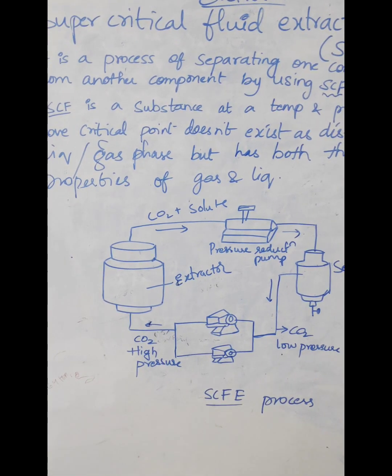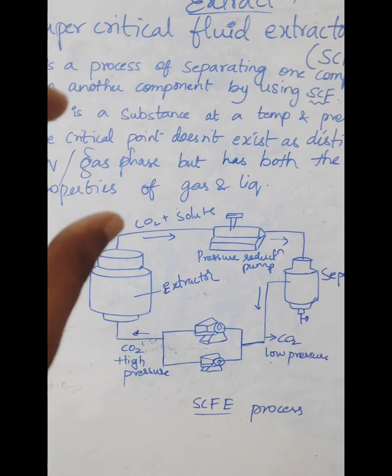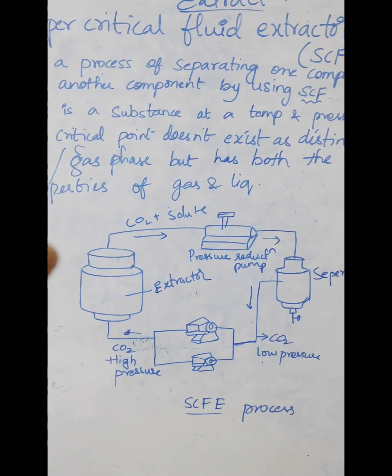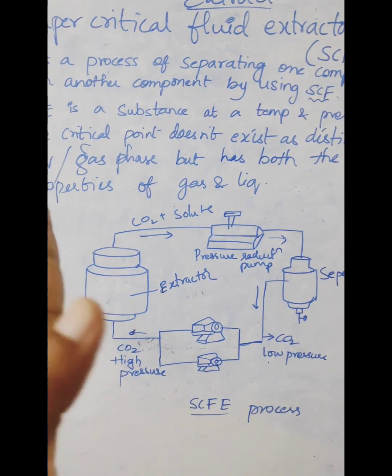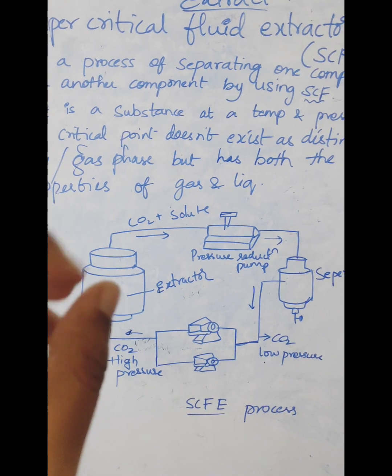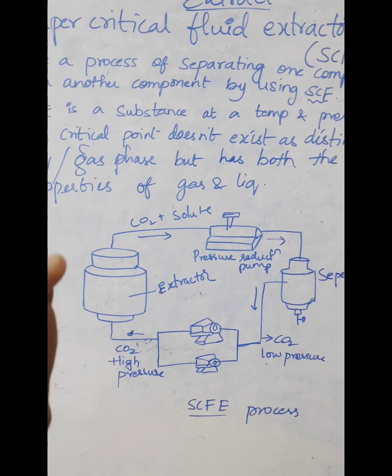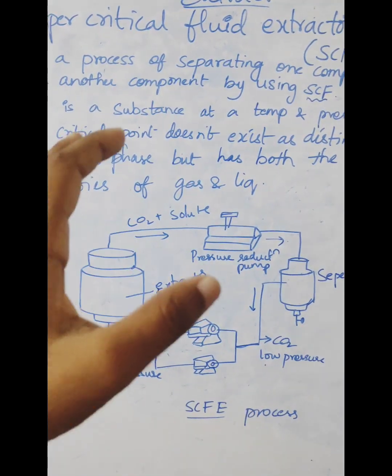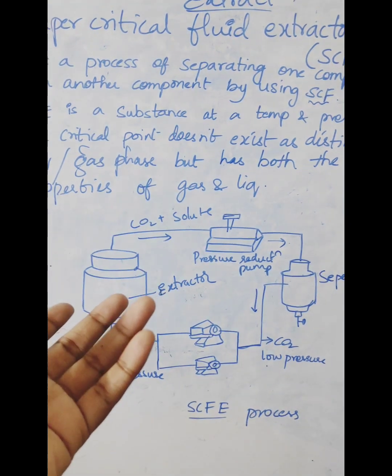So above the critical point, if you apply the pressure and temperature, the particular substance doesn't show exactly the same state. We are not able to distinguish whether it is a gas or liquid.